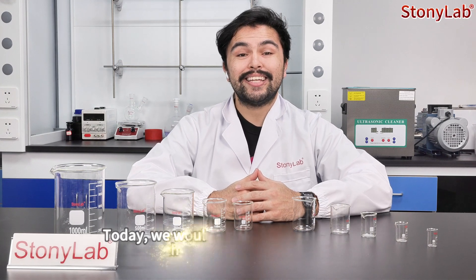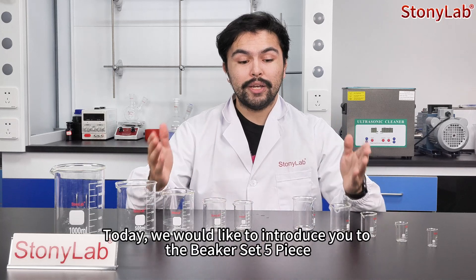Hello everyone and welcome to StonyLab. Today we would like to introduce you to the Beaker Set 5 piece.